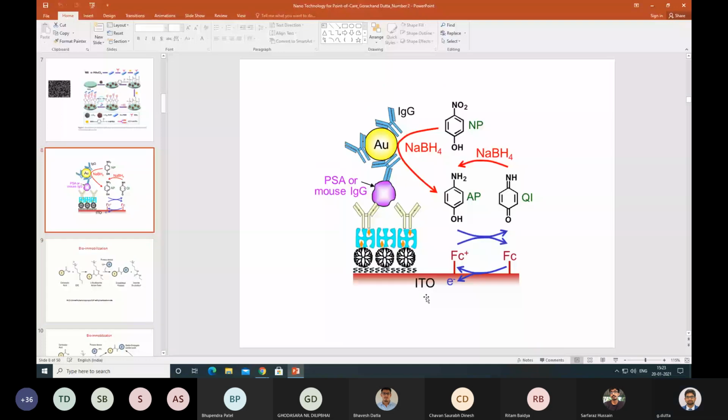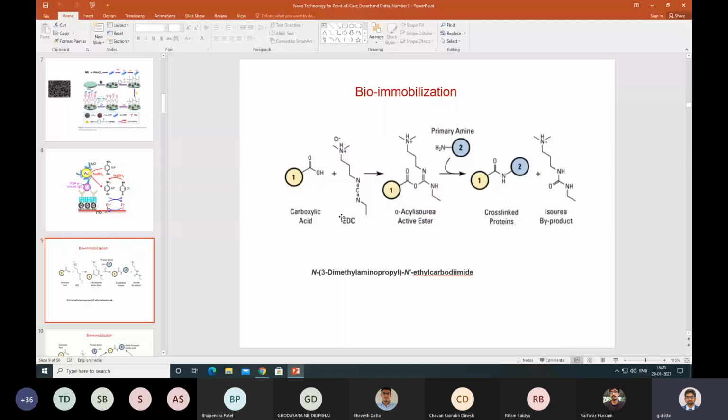I will tell you that first we will create some carboxylic acid group on the surface, and then we will activate that carboxylic acid group with some chemical like EDC. EDC is the abbreviation; the full name is N-(3-dimethylaminopropyl)-N'-ethylcarbodiimide.